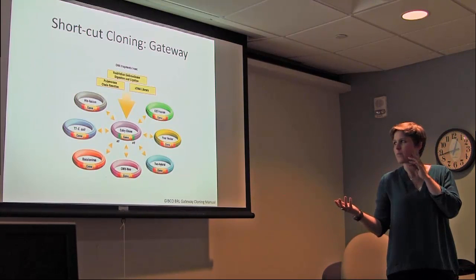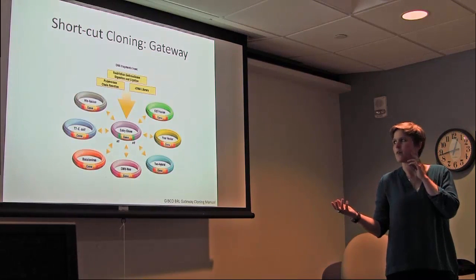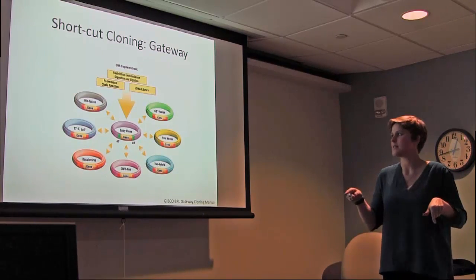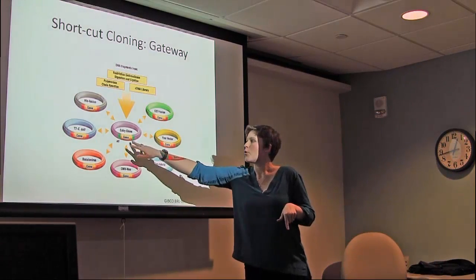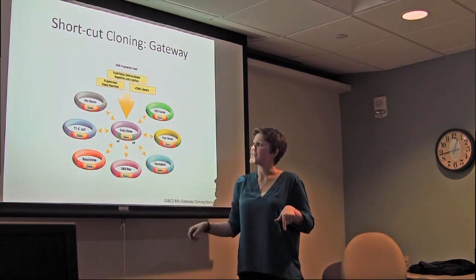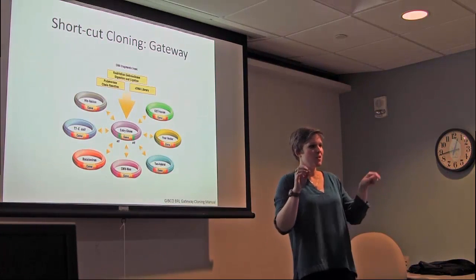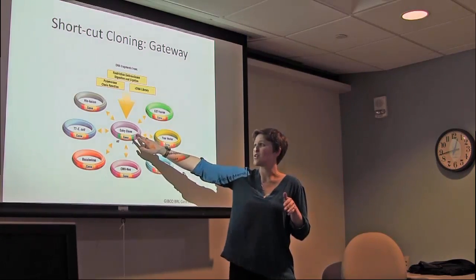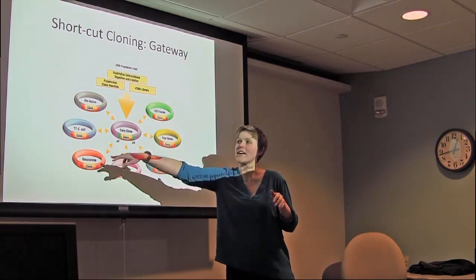I think it's viral. It's a lambda phage recombination system. Basically, you put it into these ATT sites, and once you have this entry clone, you're able to pop your insert out of this entry clone and into any other vector you might want to.